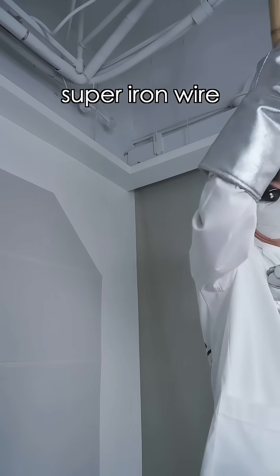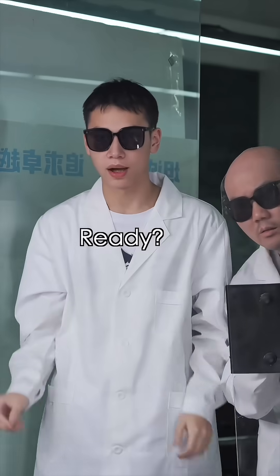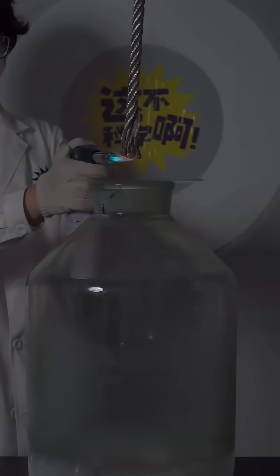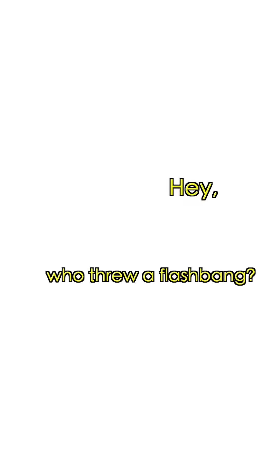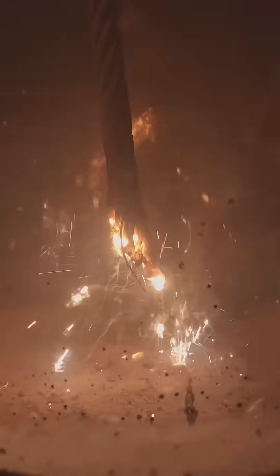Let's see if this super iron wire can create even bigger sparks. Ready? Who threw a flashbang?! It works! Go out! Go out! Go out!